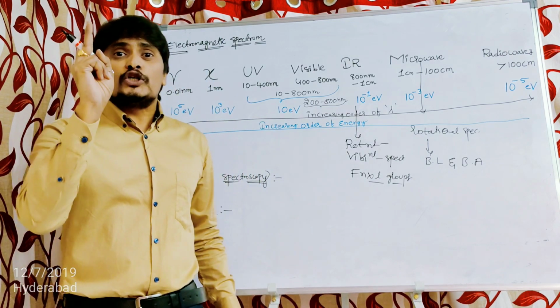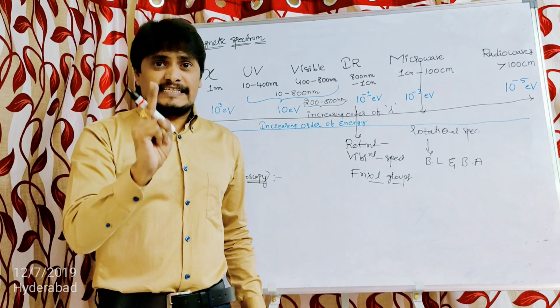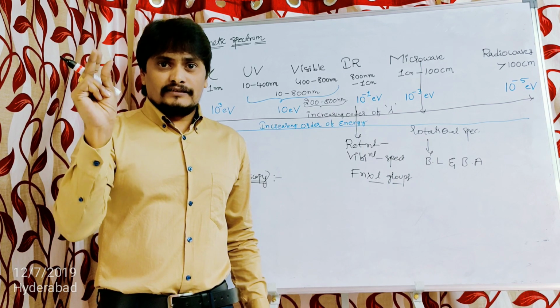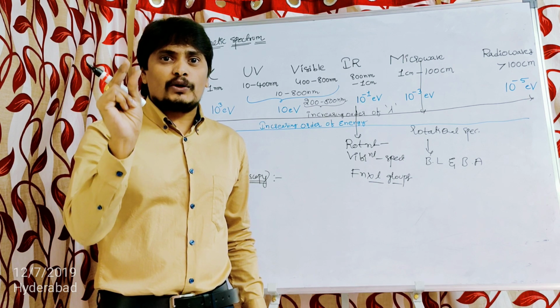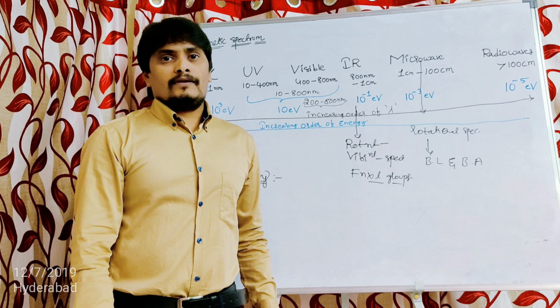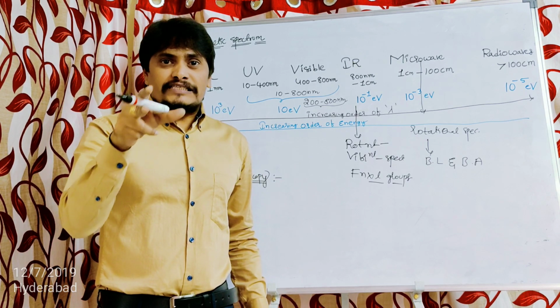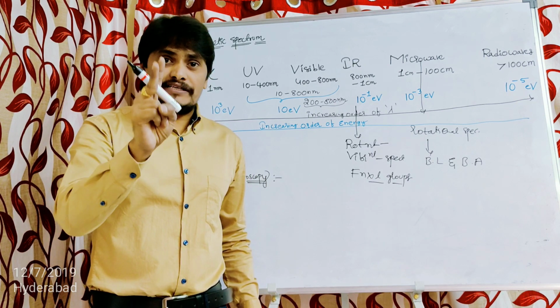So these are the two reasons which prompt us to project the UV visible radiation in the range of 200 to 800 nanometers only. So what happens when the molecules become saturated? I will discuss later, students. Keep these two reasons in mind.